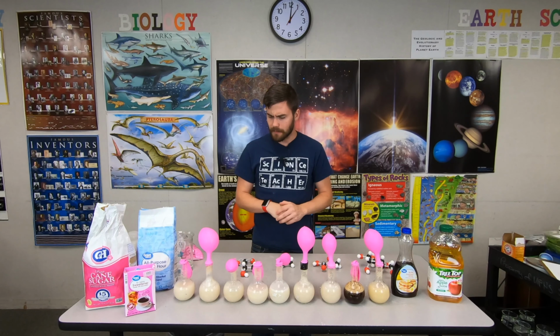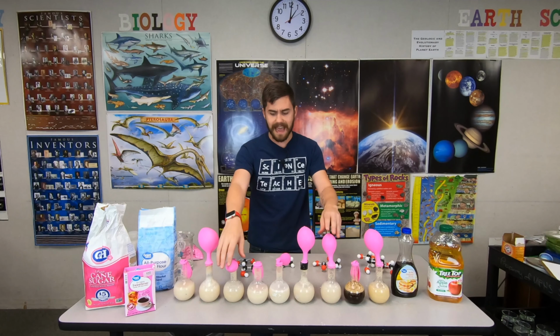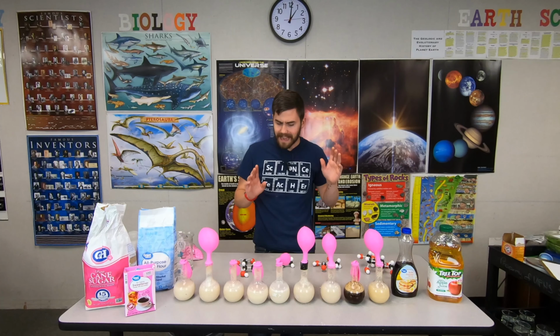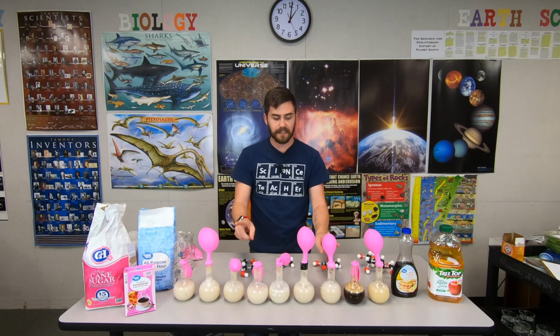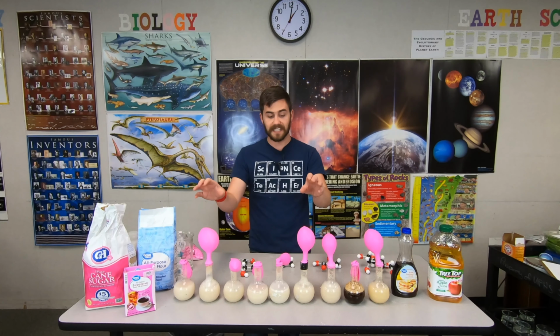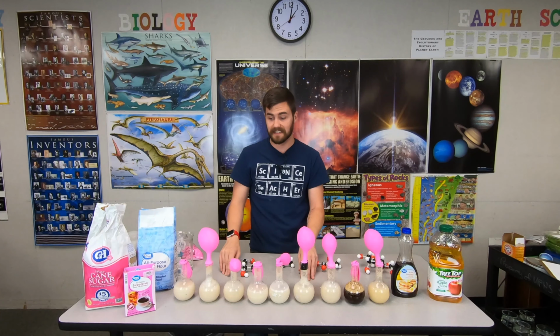Now, let's talk about why less carbohydrate produced more gas than more carbohydrate. Here's what I think happened. I think in these flasks, they're still busy breaking down the sugar and the flour. Because there was more food available, the yeast did not jump into fermentation until after these flasks did.